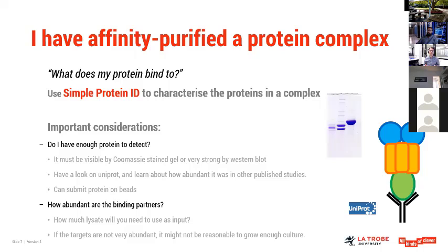And one thing I will also mention now that I thought of during question time on the protein complex is that the platform also houses four instruments that are not mass spec based, which can analyze protein-protein interactions. So you can come and talk to us and we'll tell you all about those instruments for protein-protein interactions, and some of those can help you characterize a complex.